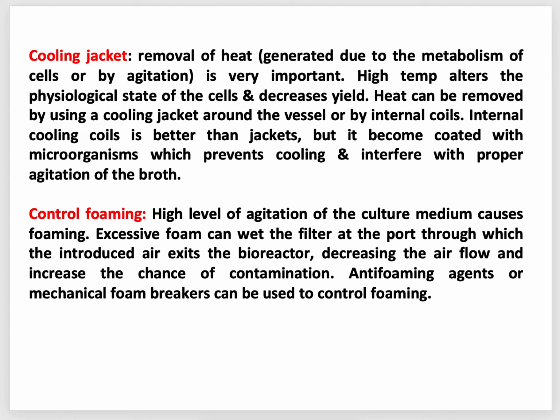Well. Some more parts of the bioreactor. Cooling jacket. So what can be the purpose of the cooling jacket? It will cool down the bioreactor. So why is cooling necessary? When the fermentation is on, lots of heat will be produced because of the physiological activity, because of the metabolism by the cells, right? When the fermentation process is on, lots of chemical and biochemical reactions will be going on inside there.